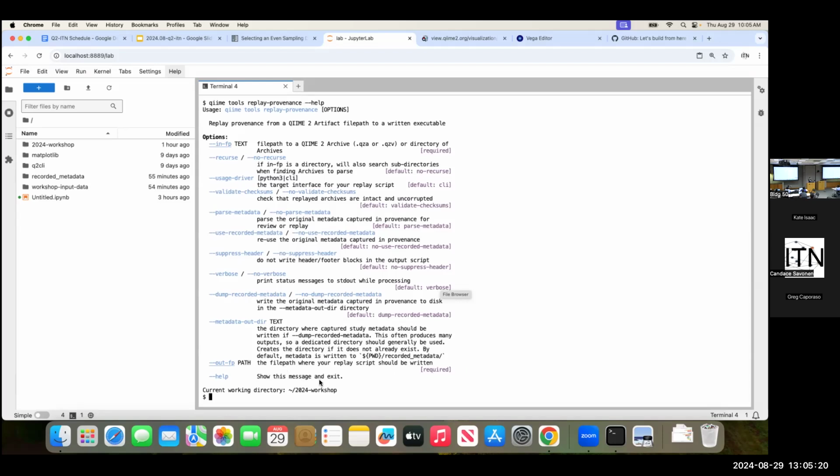Okay, so I'm going to press the up arrow to get back to my command, hopefully. It's not taking me typing, so maybe I just need to wait for a second. If you aren't frozen, you can press the up arrow once and you should get your command back. If you're having trouble, raise your hand and we can come help you. I'm not sure why it's being slow on my screen here.